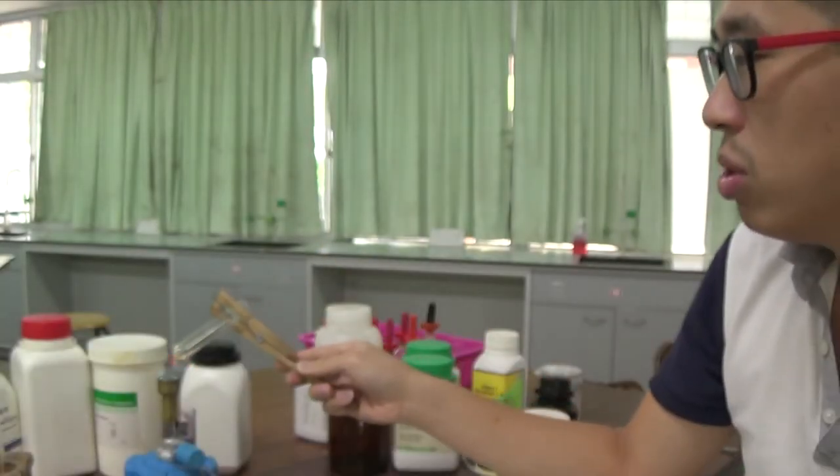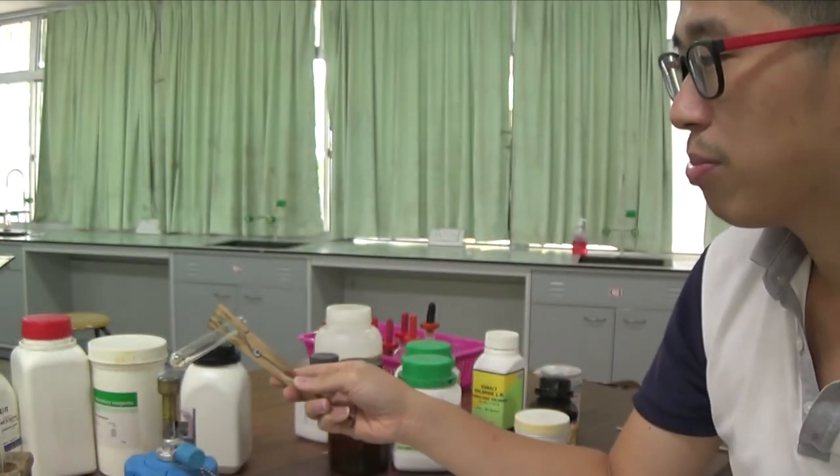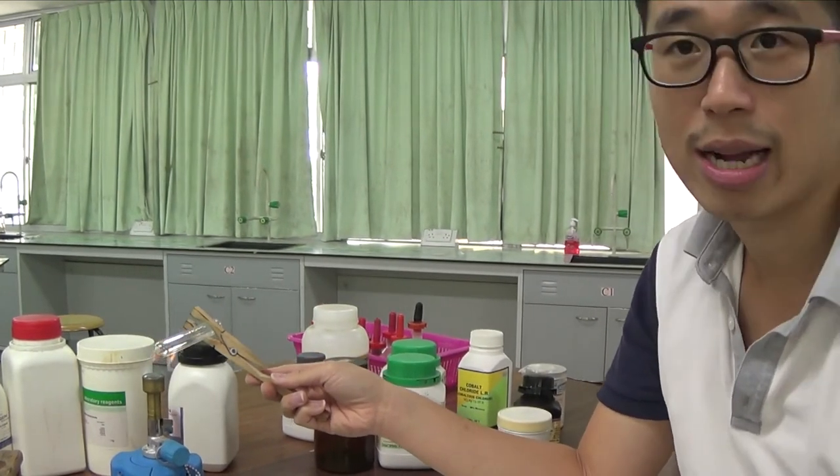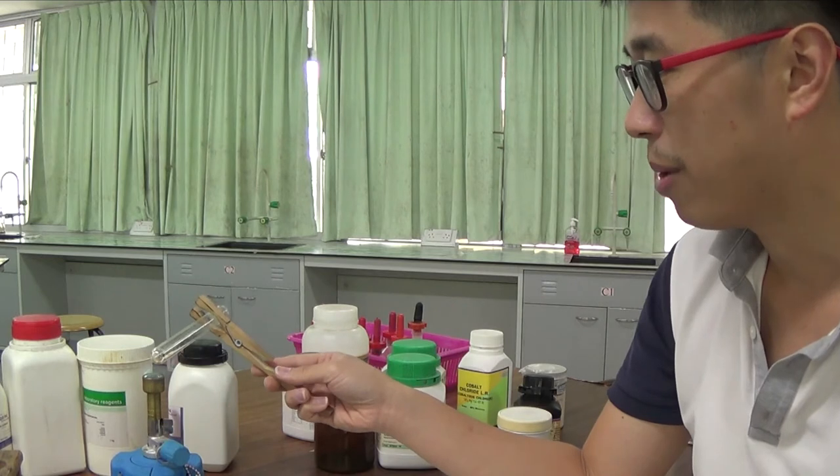What happened to the solid? Because the solid was not white, it was green. Now it's a bit orange-yellow. Not too sure if it is that clear or not, but it's gone a bit orangey-yellow. And that's the beauty of transition metal compounds, because we're dealing with a lot of colors, right? So a lot of students get really excited when they work with transition metal compounds, okay?